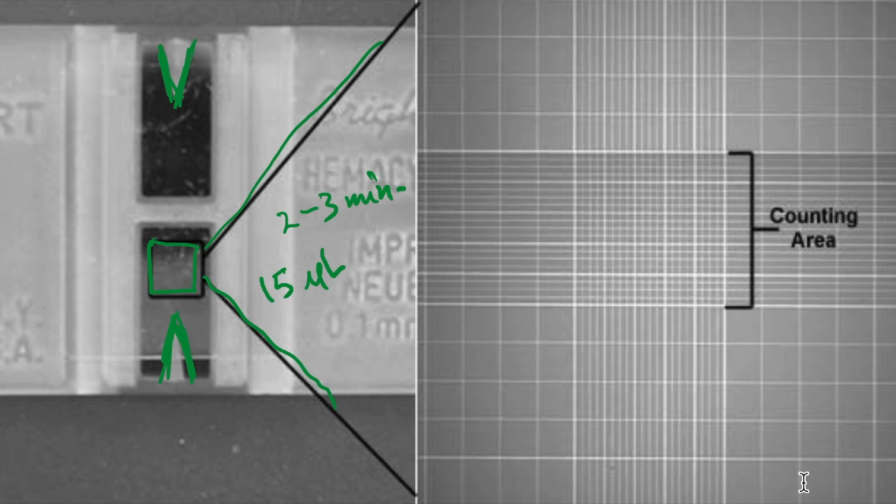And then there's a covering plastic piece that is slipped on top of this. It's not visible, but if you could make out these boundaries, perhaps it's visible around here.